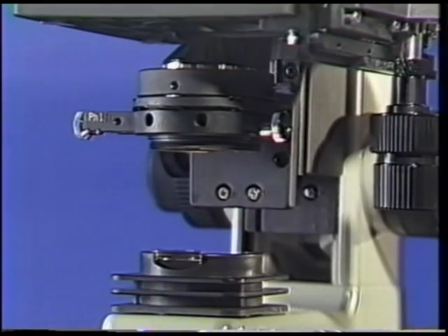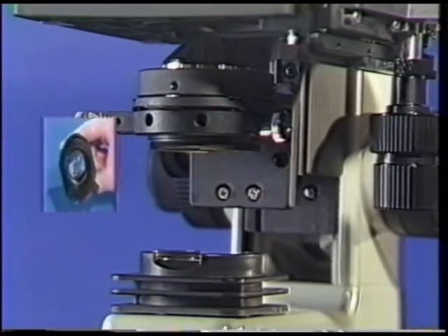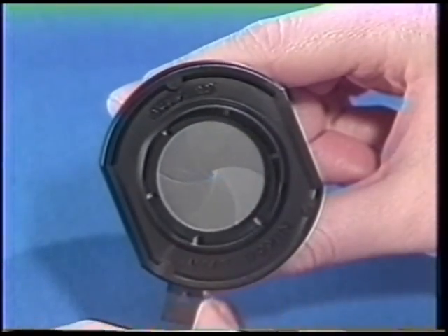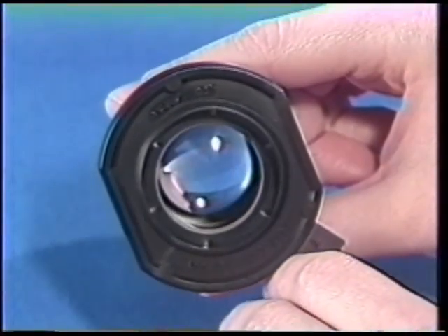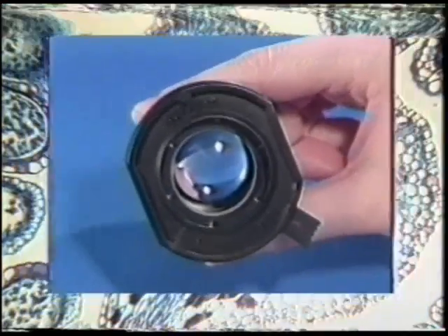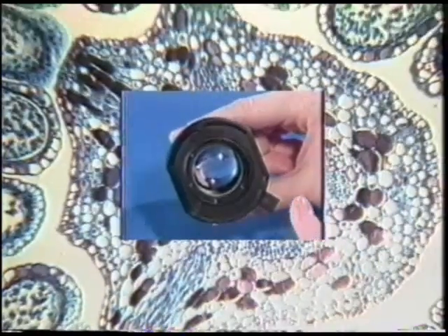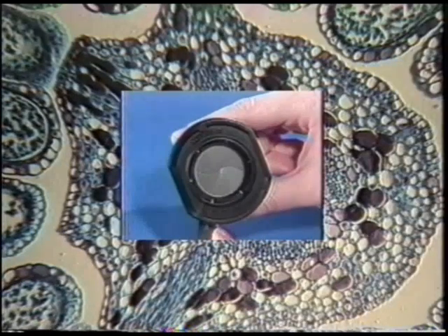Within the condenser is an aperture diaphragm, similar to the iris of a camera lens. The iris diaphragm controls the angle of light passing through the condenser. Closing down the diaphragm increases image contrast and depth of field, but may decrease the resolving capabilities of the objective lens.